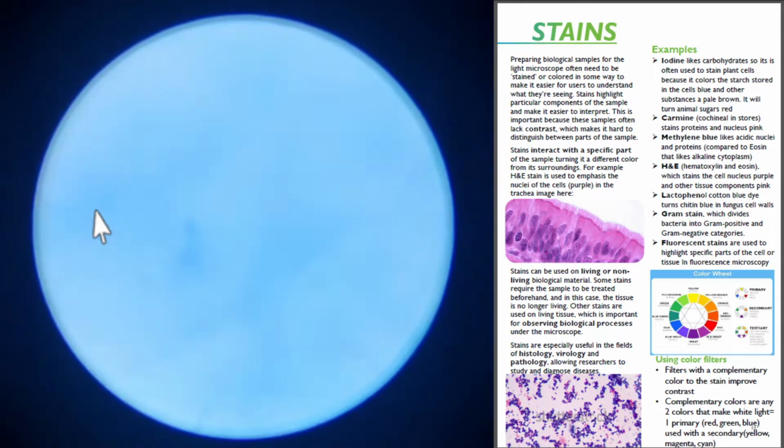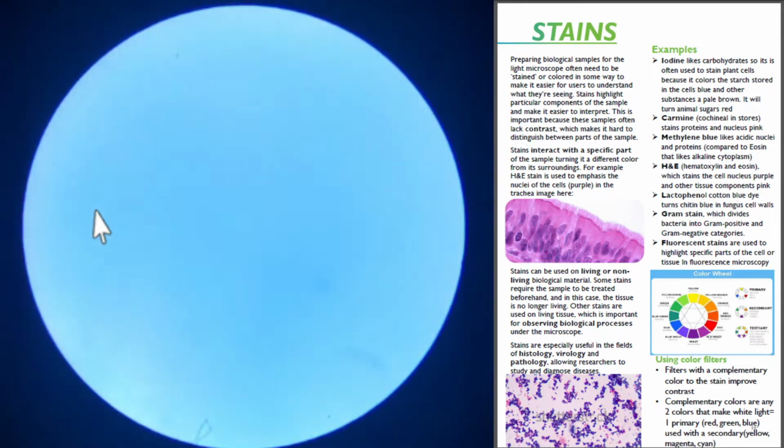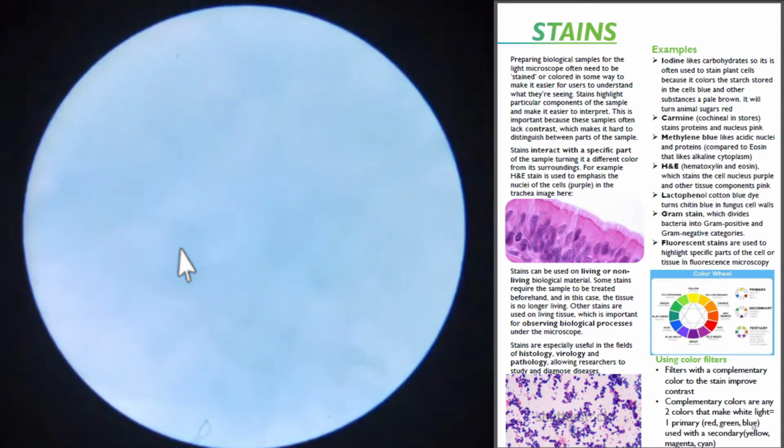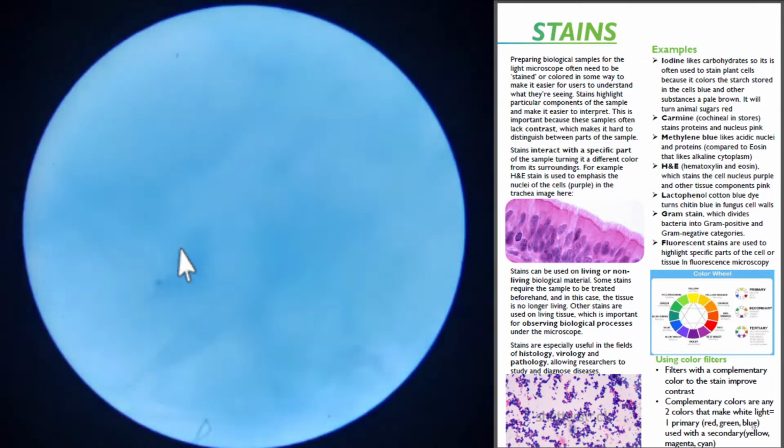I see it hiding. Let's change our rheostat, the brightness. That helps a little bit. But yeah, that autofocus is still on and causing problems. Adjust the rheostat. Do my find. Oh, I lost it. Oh well.